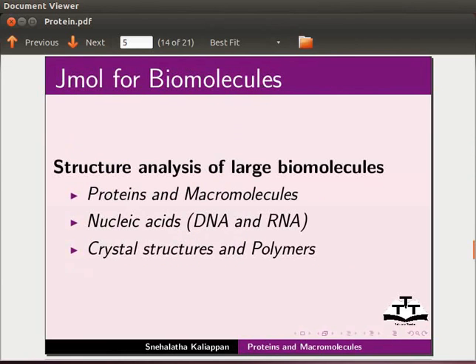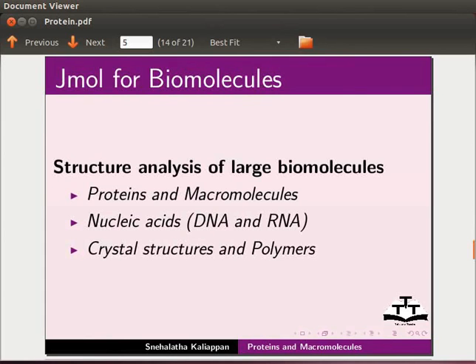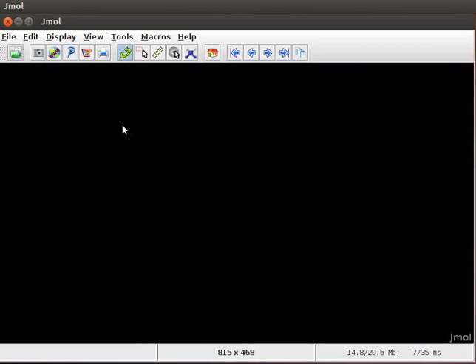Structure analysis of large biomolecules such as proteins and macromolecules, nucleic acids, DNA and RNA, crystal structures and polymers can be done using jmol application. Here I have opened a new jmol window.